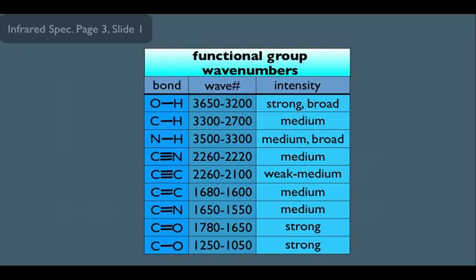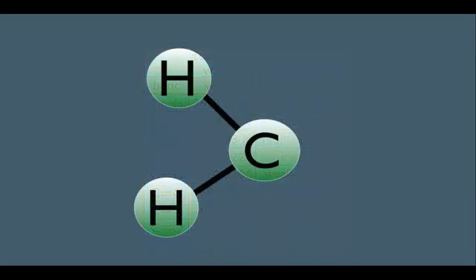However, there's one more thing I want to talk about here. Remember, we saw with our carbonyl example that it technically had two absorption bands, one for the stretching and one for the wagging. As we progress through the IR material, we're going to see that functional groups can have many absorption bands. And let's see why here for a second.